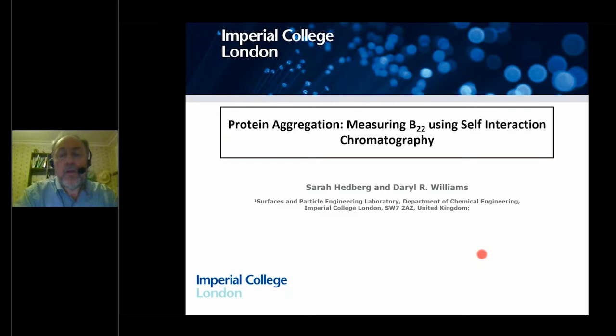Does the quality of column packing affect the IGC testing results? The short answer is no. We've packed hundreds, indeed thousands of columns over the last 20 years now. And I would say there's probably about 1 in 500 samples where it's a bit more difficult to pack the samples. But for 99% of the time, if I pack a column and you pack a column, or Ramiz packs a column, we're all going to get the same result. So the column packing is not a challenge and is not an issue for anybody.